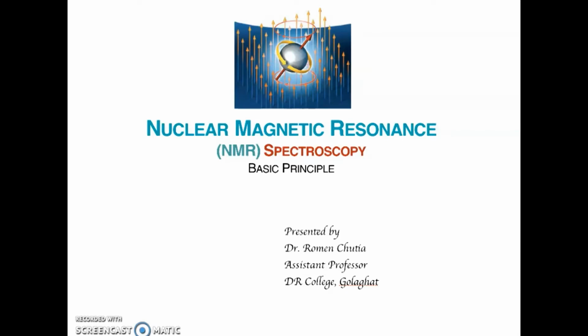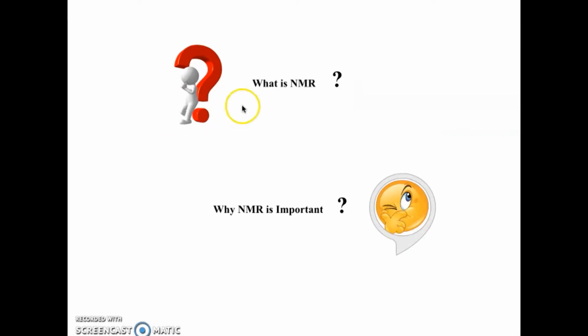Hello everyone. Today let's discuss NMR spectroscopy, or Nuclear Magnetic Resonance Spectroscopy. We will discuss only the basic principle. So what is NMR and why is NMR so important? Let me tell you, NMR is the most widely used spectroscopy in organic chemistry.